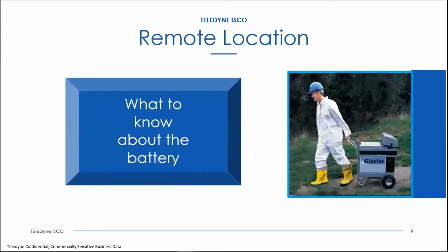Talking about batteries, there are different types of batteries you can use with the samplers. The two main ones that we have are either a lead acid or a NiCad. A lead acid is like your car battery, basically. It's a bigger, higher capacity battery. It has the same downside as your car battery. In the wintertime, you get less cranking amps out of it, and the batteries just don't last as long. You don't get as much capacity out of it. When the wintertime is real cold and you try to start your car, it turns over really slowly. But you do get more capacity out of the lead acid batteries.